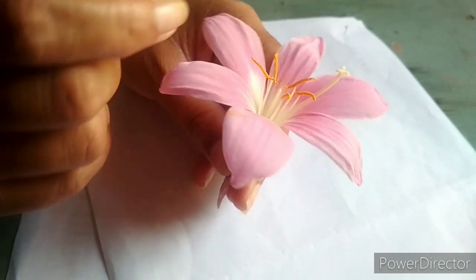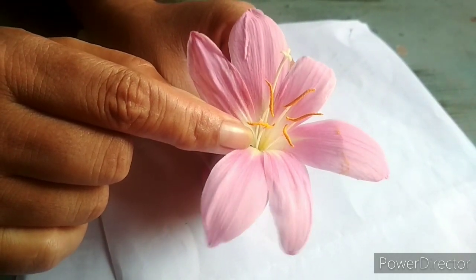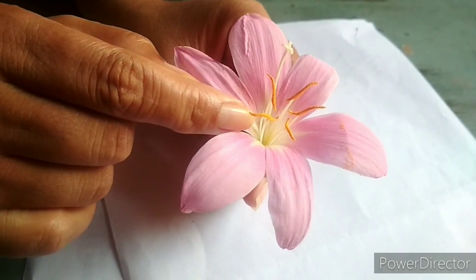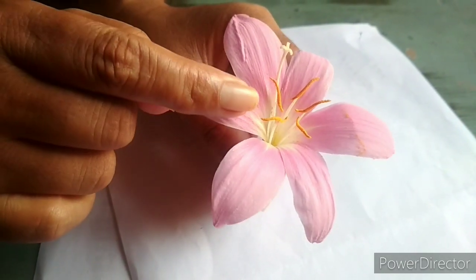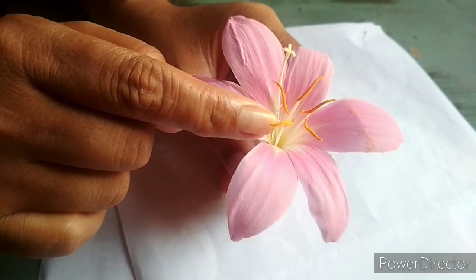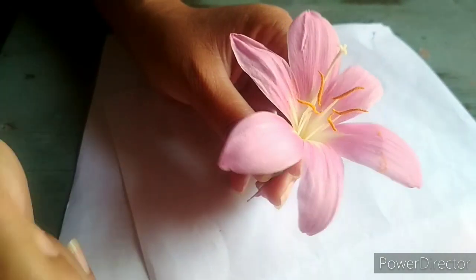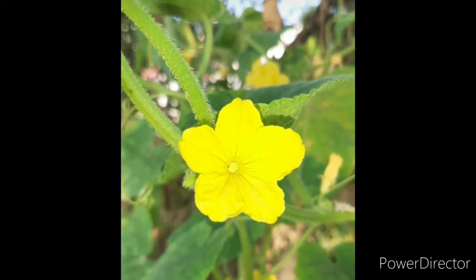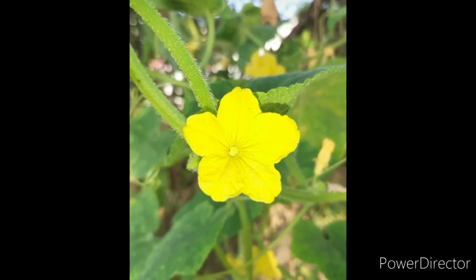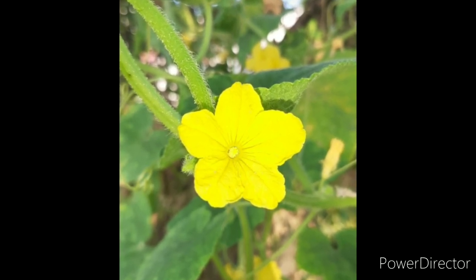A flower that consists of both parts — stamen and pistil — in one flower is known as a bisexual flower. A flower that has only one part, either stamen or pistil, is known as a unisexual flower.